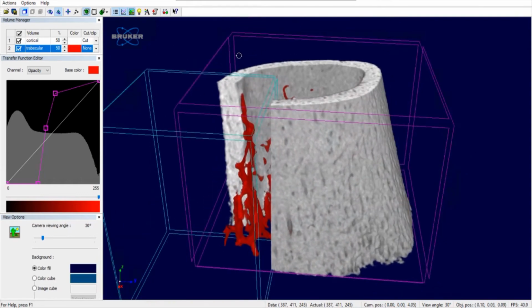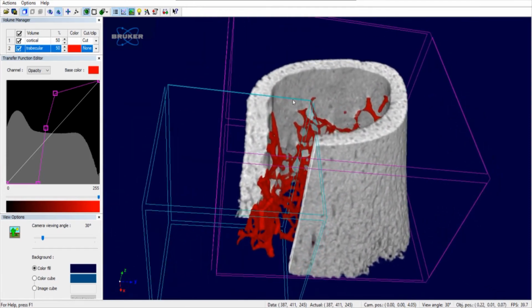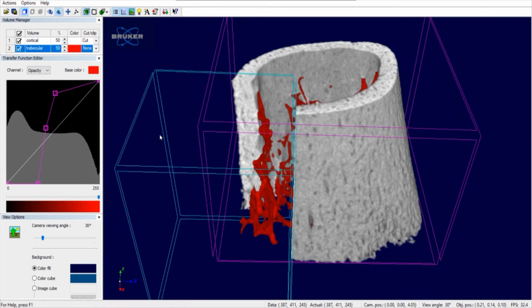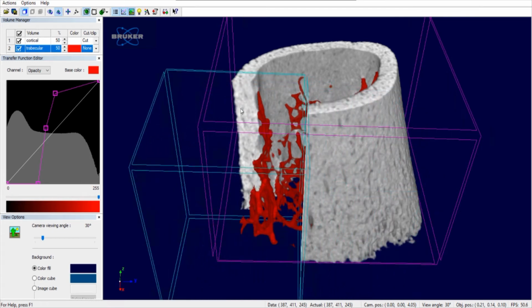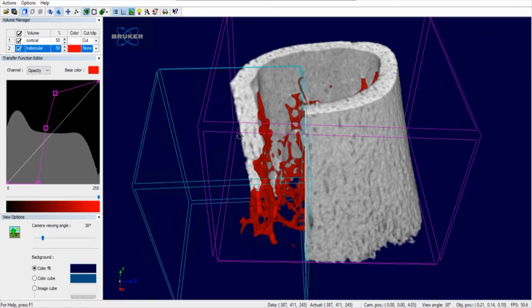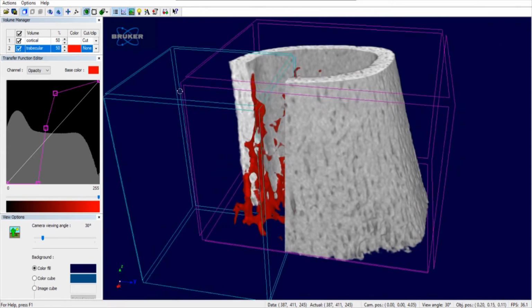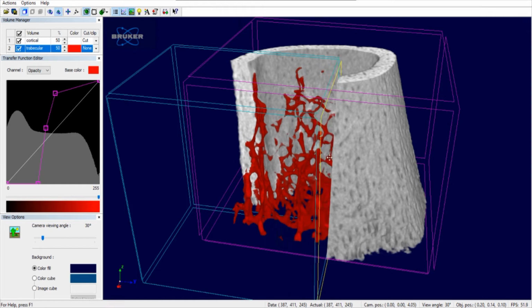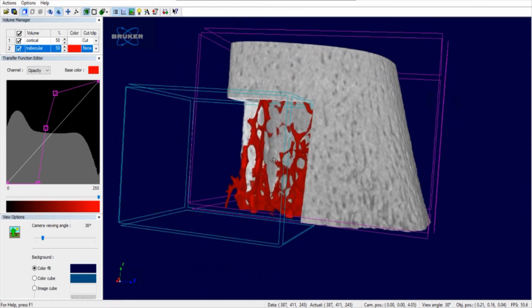And how can I position this box? If I hold the button of the mouse, it is going to either translate the left one or the right one is going to rotate. And it never happens to this one unless you hold Alt. So when you hold Alt, everything happens to the box. So you can reposition the box with the left button of the mouse. If you right click, you can rotate, and also the same thing that you can do with the main box, the main frame, you can also do with this one as long as you hold Alt. So if I hold Alt and Shift at the same time and hold with the left button one of the faces, I can drag the face and change the size in any position. So I released now, and I'm using just the mouse.